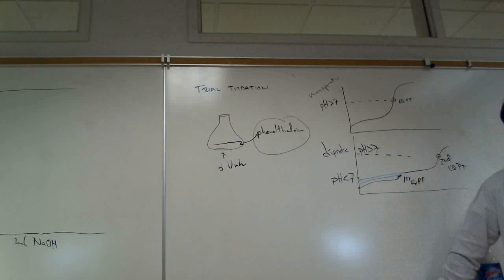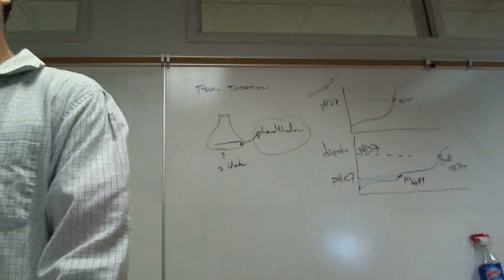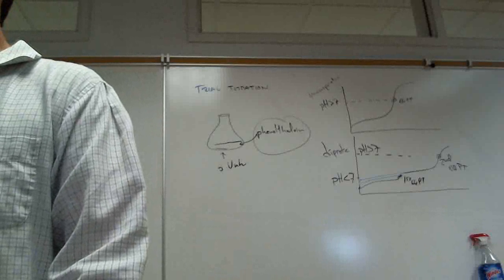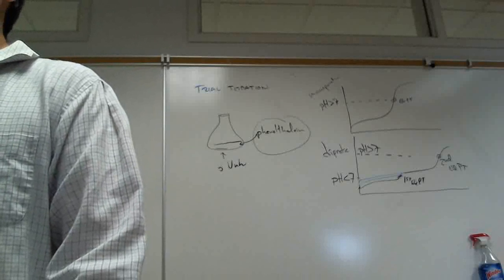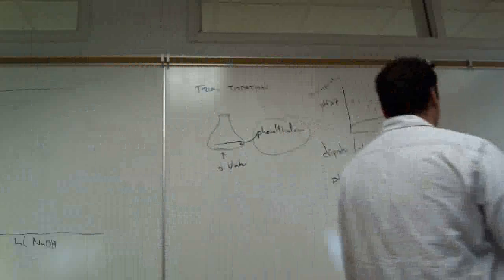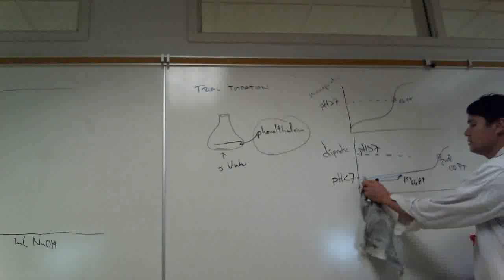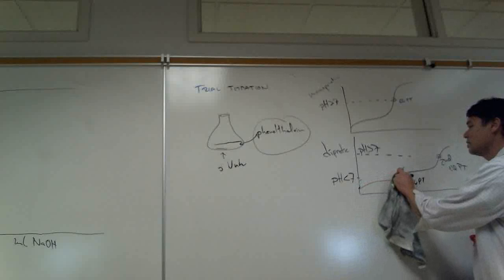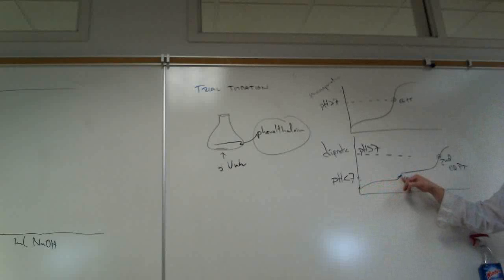And so this is why there is a procedure for this. Maybe some of you might have seen it, but the procedure says add this many milliliters of water. When you add that many milliliters of water to your acid, it can be way too dilute, and you don't even really see this first equivalence point, which means a lot of people get it wrong. And so the data collection is simple enough, so just try to explain it here. Make it as concentrated as possible to make this as pronounced as possible, because it's not a very big jump.